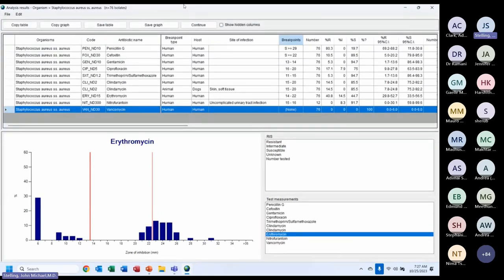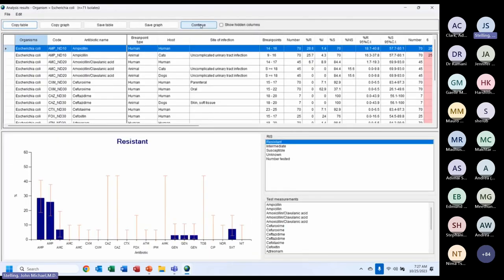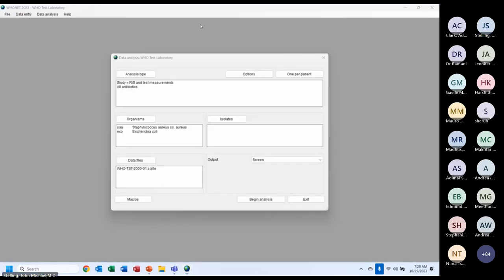I can copy and paste to Excel, Word, or PowerPoint, or save the table. But this is not today's main subject, so I'll click Continue to see E. coli results, then Continue again. That is how you run a normal Hoonet analysis. I'll now go back to the PowerPoint.